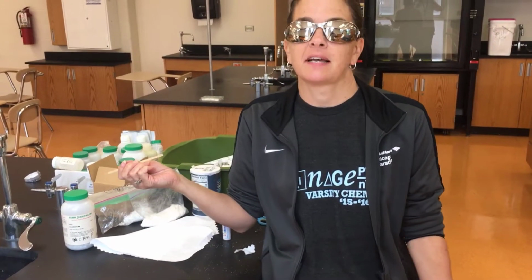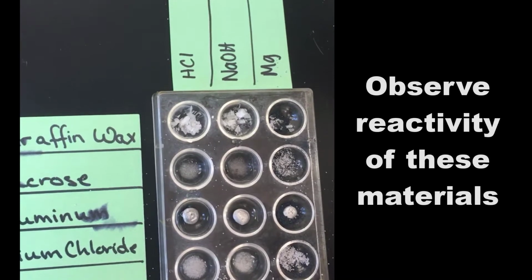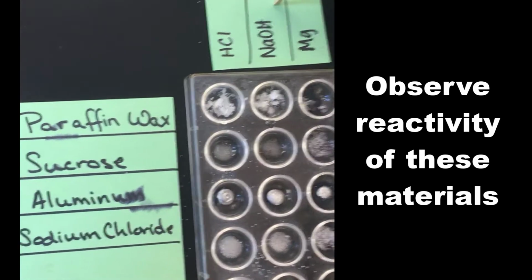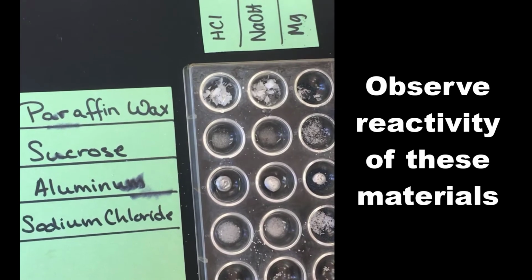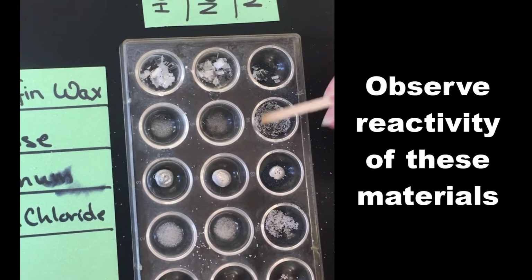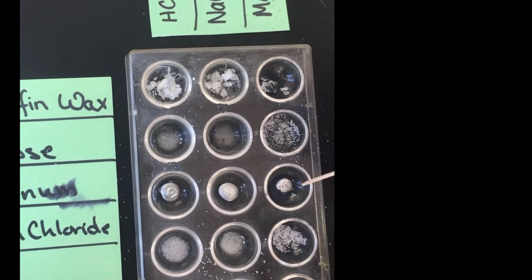Okay, super exciting results. In this particular instance, when I'm looking at it, I don't see much of anything happening. Now, you might see some dissolving of your sodium chloride, but remember, our hydrochloric acid and our sodium hydroxide are both in water solutions. So you have to keep that in mind. And the darkness that we see here, that is the magnesium powder. So when I put the magnesium powder on, I didn't see any dramatic changes. It just seemed to mix with the substances.